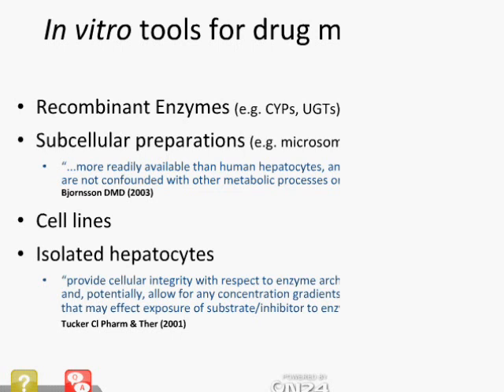Other applications, such as induction, can only be performed in hepatocytes and not in microsomes due to the need of transcriptional and translational machinery found in whole cells.